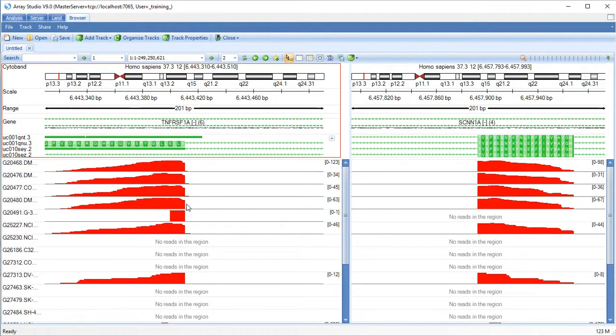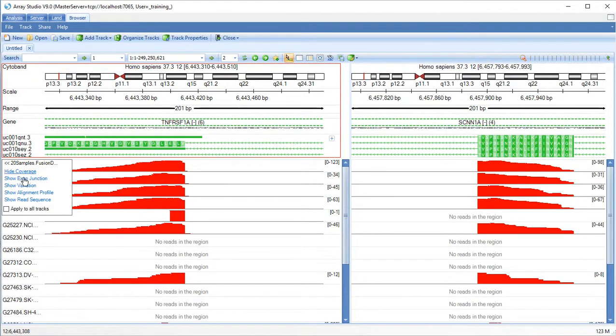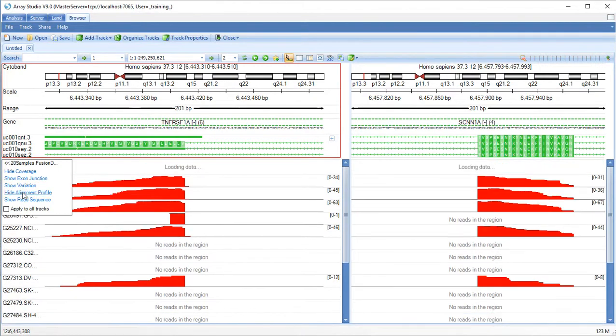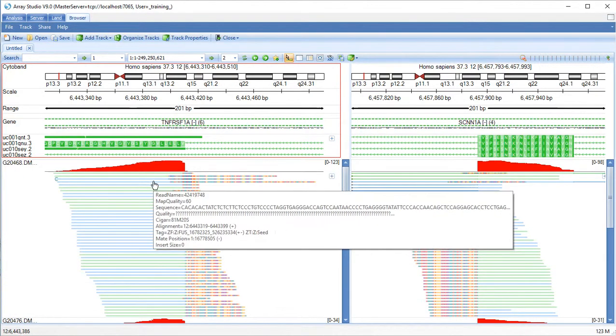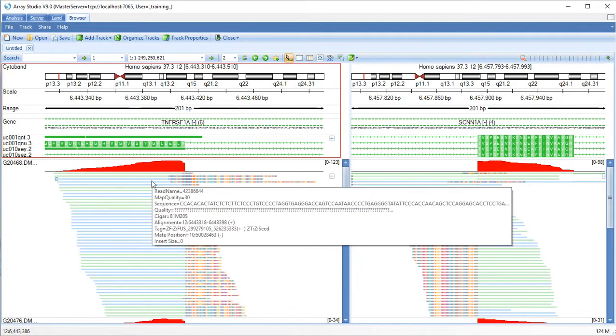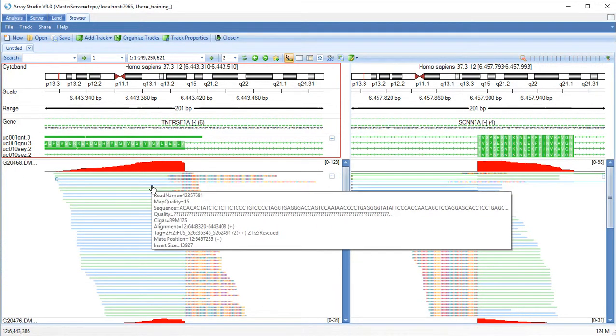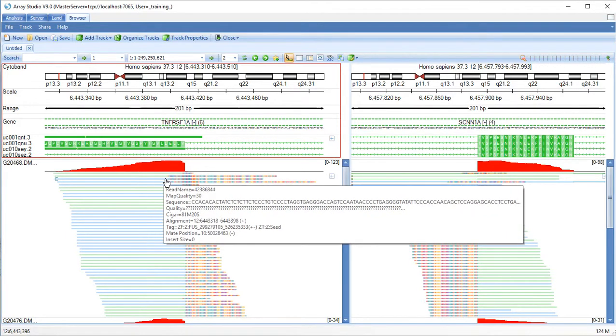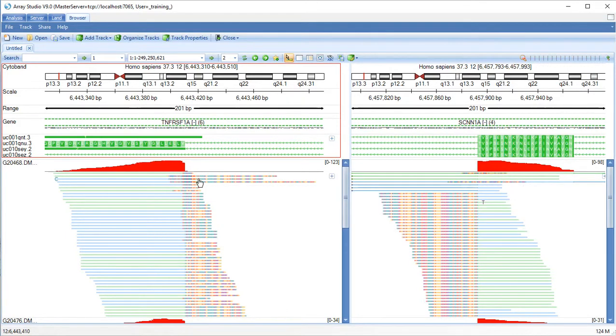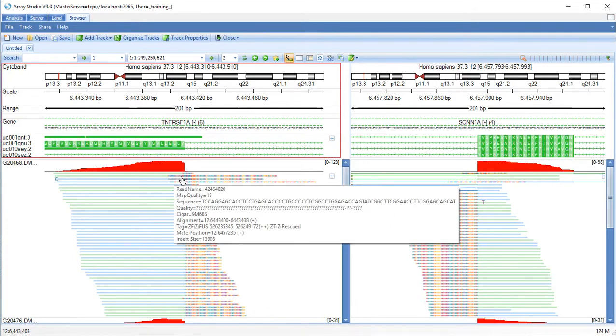We can see an alignment profile. Blue reads are in the forward orientation. Green reads are in reverse orientation. Other colors indicate positions where it was not mapped.